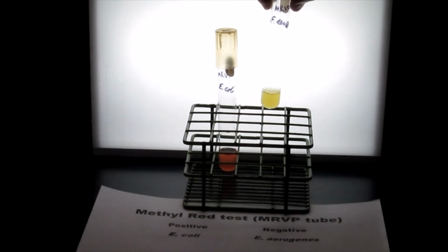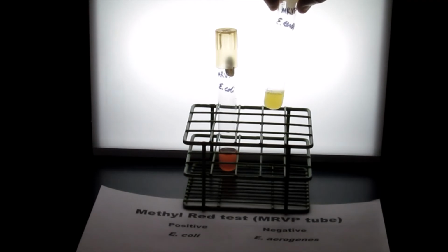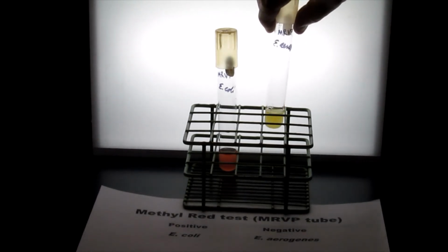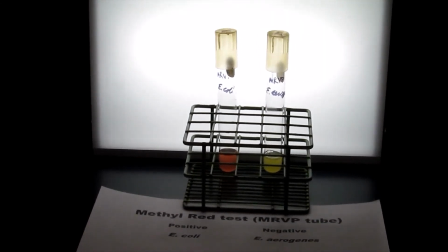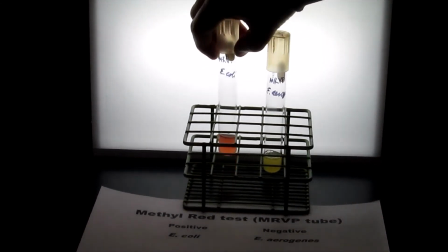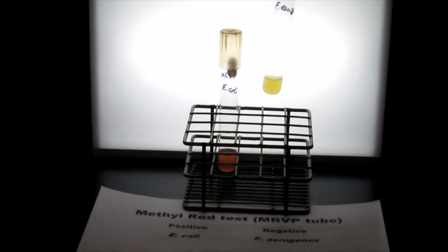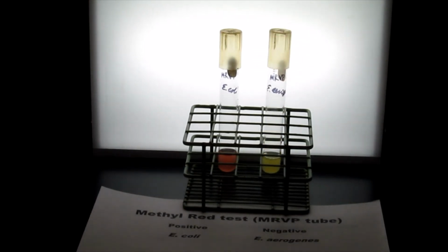whereas the E. aerogenes, when you add the methyl red indicator, turns yellow, and it does not indicate any acid production when you grow this bacteria in this MRVP broth. So we have a positive result here for E. coli and a negative result for acid production in the case of E. aerogenes.